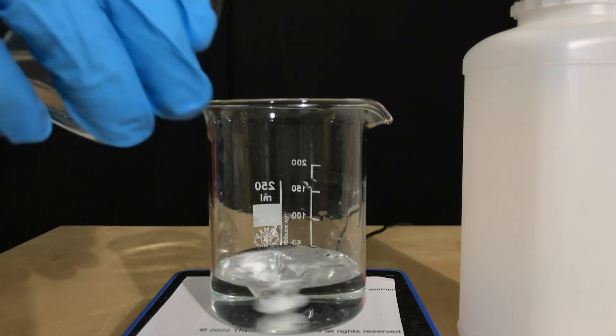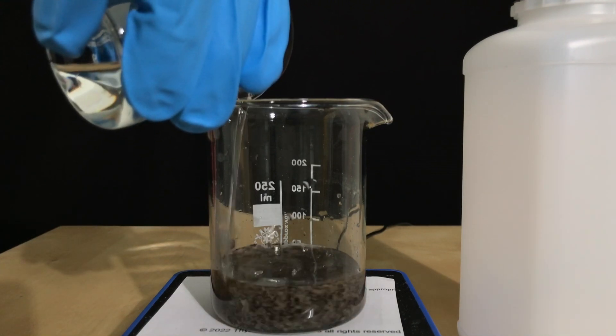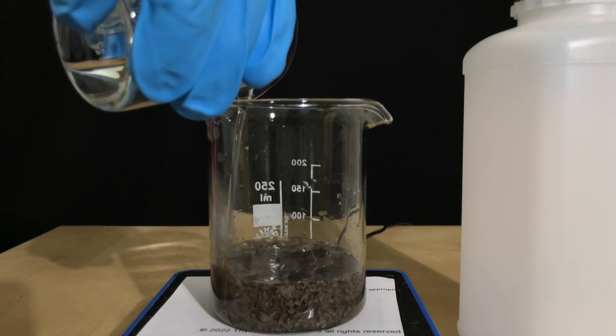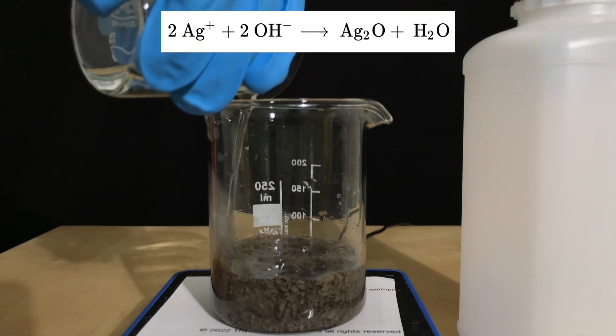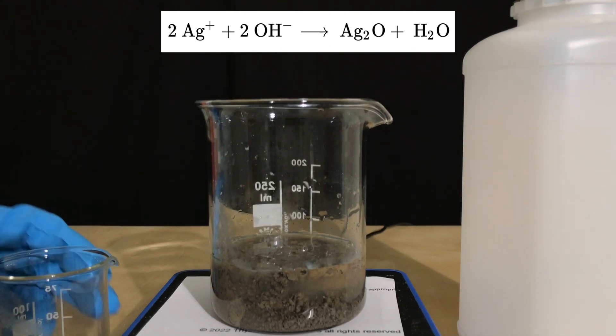The solutions of sodium hydroxide and silver nitrate only have to be combined. After combining them, you immediately see this blackish-brown precipitate. As silver(I) ions react with hydroxide ions, insoluble silver(I) oxide crashes out and water is formed.